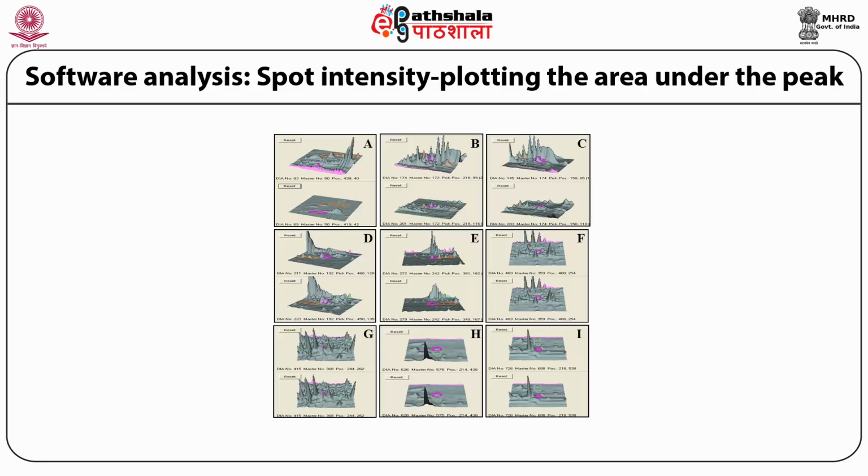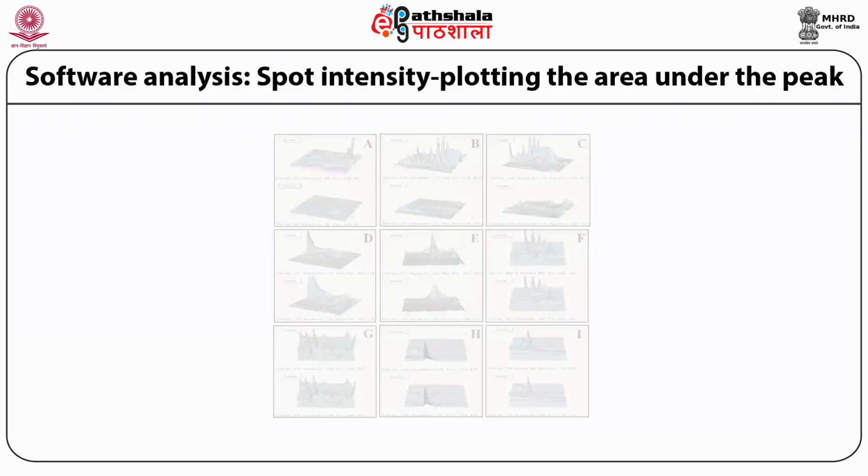The differentially expressed spots were closely analyzed, and based upon the intensity, which pertains to the area under that particular peak, reflects the differential expression, and the regulation across the three sets of biological gels are then considered to mark out the spots with a certain type of accuracy.